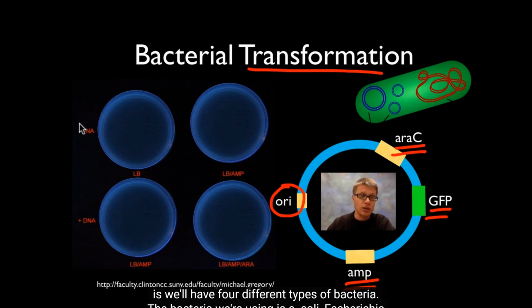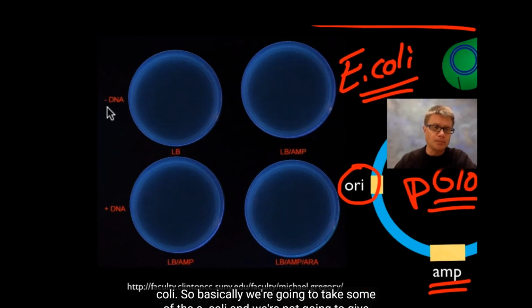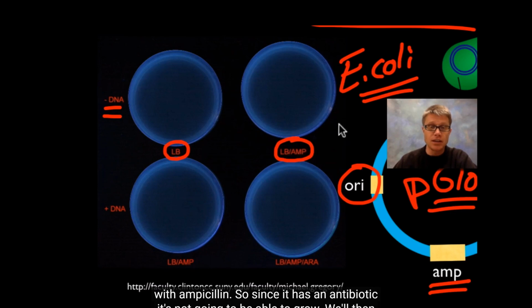And so basically what we'll do is we'll have 4 different types of bacteria. The bacteria we're using is E. coli, Escherichia coli. So basically we're going to take some of the E. coli, and we're not going to give it the plasmid, so it gets no DNA. We'll plate some of that on what's called Luria broth. That's just basically food for bacteria. And then we'll plate some of it on Luria broth with ampicillin. So since it has an antibiotic, it's not going to be able to grow.